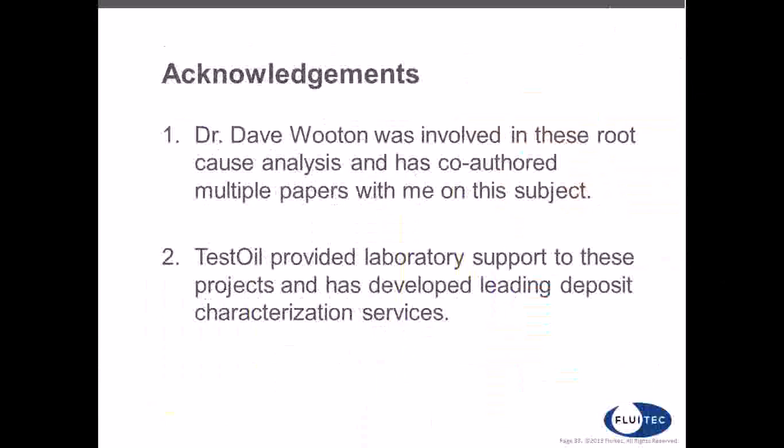So even though you may not see any evidence of mineral oil contamination or hydrocarbons in the PAG fluid, there may in fact be evidence of hydrocarbons in black deposits.